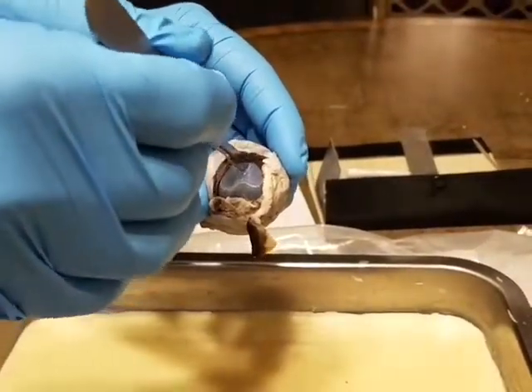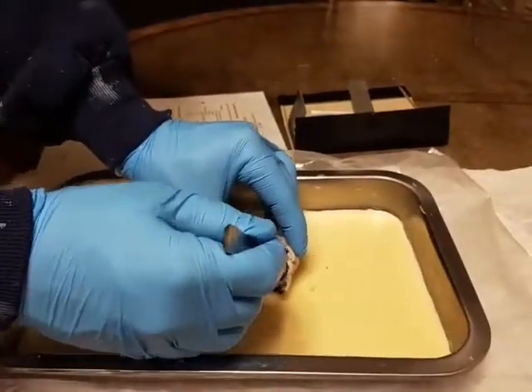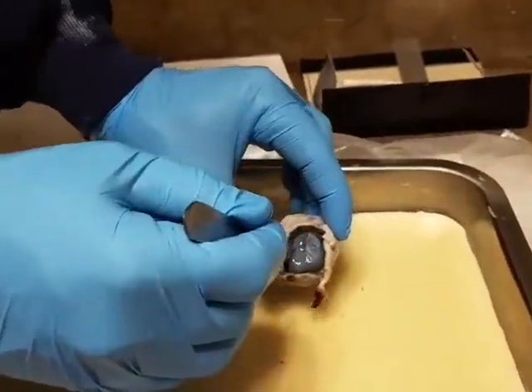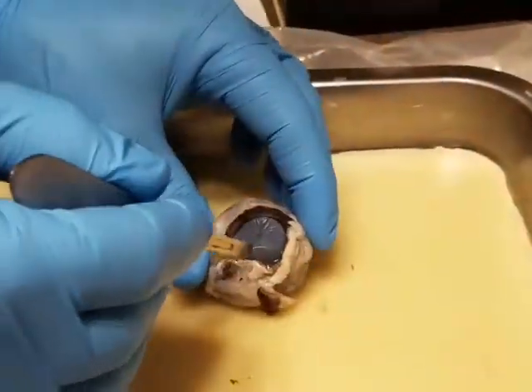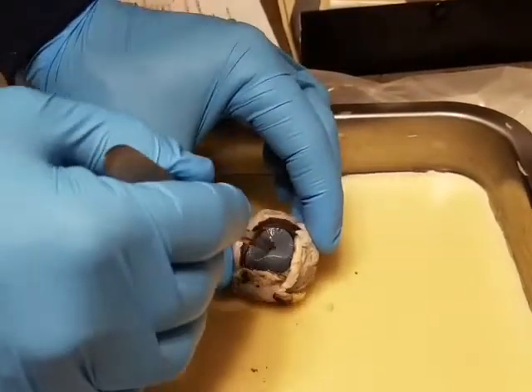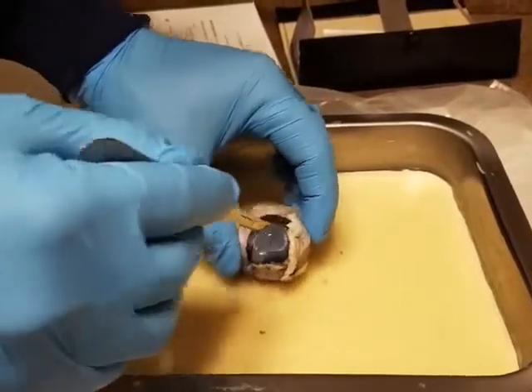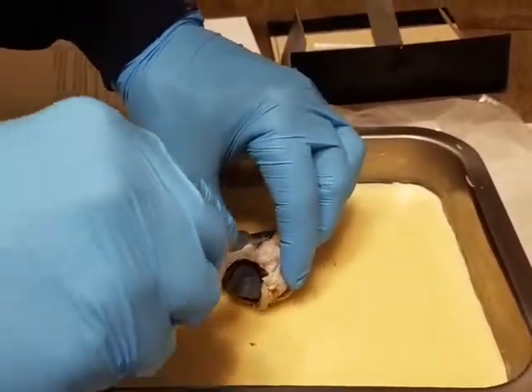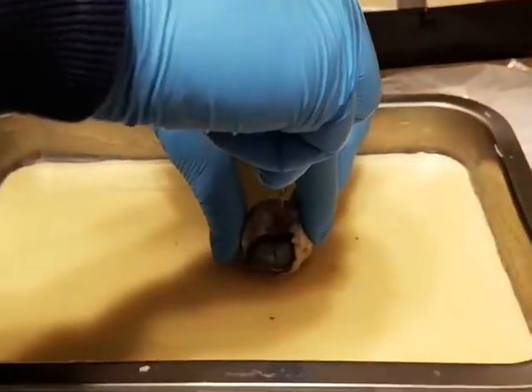Let's see. Ooh, that was very hard. If you can see the fluid coming out right there, that's the aqueous humor. I hope I didn't cut too deep, so I could get in there a little bit. Let's see if I could cut into this scleria a little bit.